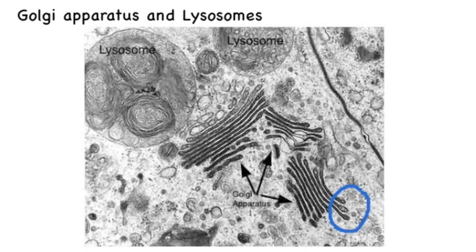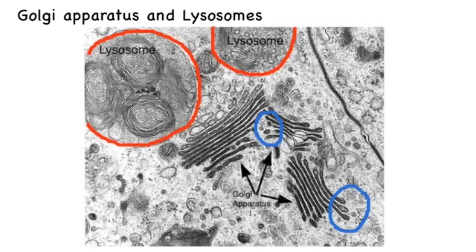Here we are able to identify the Golgi apparatus by its curved shape and by the vesicles circled in blue at the end of the tubules. We can also identify the lysosomes, which I'm circling in red, and relatively these are a little larger than the Golgi apparatus.